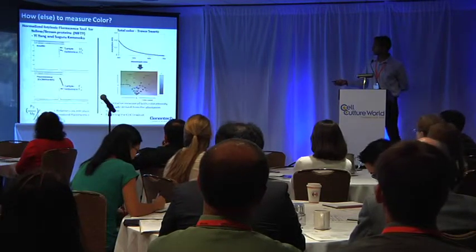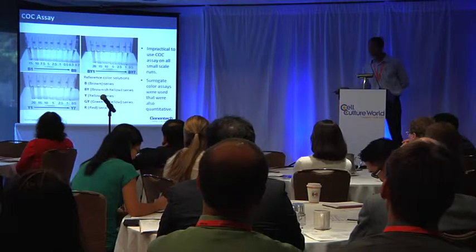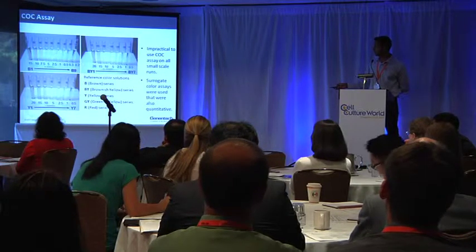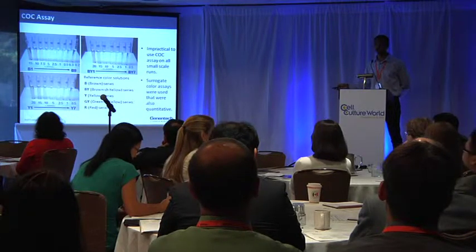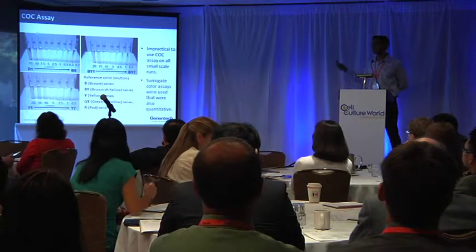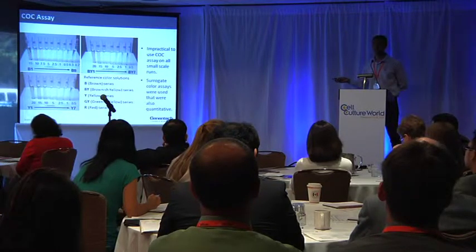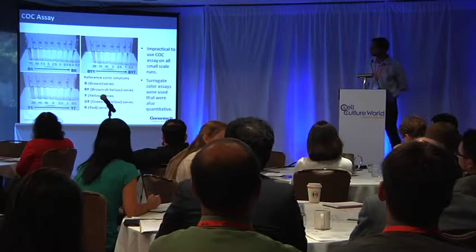There are standard references in different color series. This is brown for B, BY being brown yellow, and Y for yellow. There's also green yellow and red series, which I'm not showing here. And each of these color series has serially diluted samples. So you basically take your sample and compare it visually. So it's done by a technician who's trained in this and visually compares it against these samples and says, this is less than or equal to a certain other standard on this.